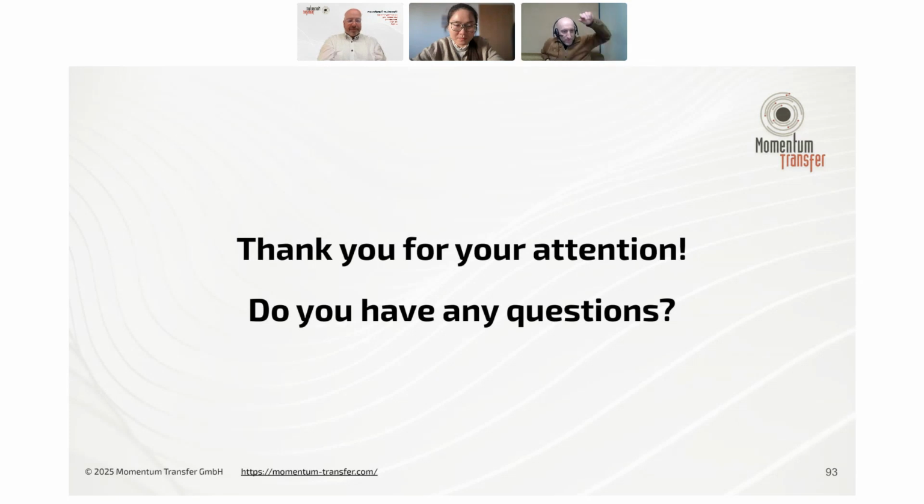For phase ID, right now I'm typically using the Sieve tool in the PDF-5+ database. Maybe you've also seen we've put some posts on it, but we're actually developing a search-match tool to work in our platform, and we'll be releasing a version of that probably by the end of the month. That will work seamlessly with data that you collect with us coming back into your account in the web application. To start, that will host structures from the COD.